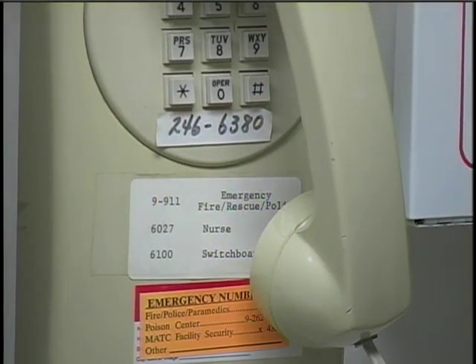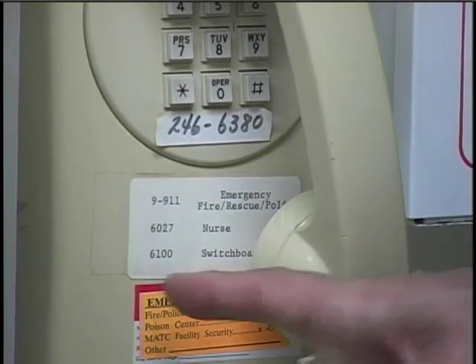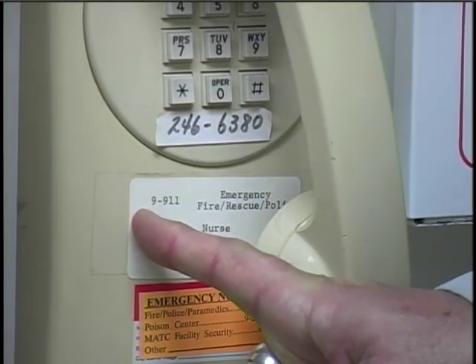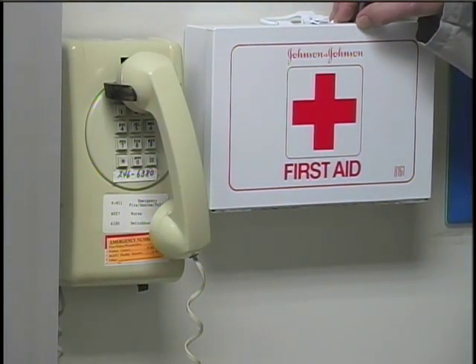The phone and the first aid kit are located on the wall near the chalkboard. If you needed to dial 911 for an emergency, you'd have to dial another 9 first, as the sign on the phone says. Next to the phone is the first aid kit. It has gauze and adhesive bandages for minor cuts and burns. It's not a good idea to work in a chemistry lab with an exposed cut, so let your instructor know if you need a bandage.